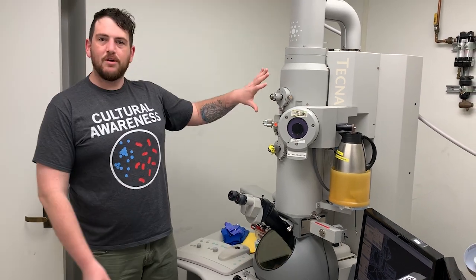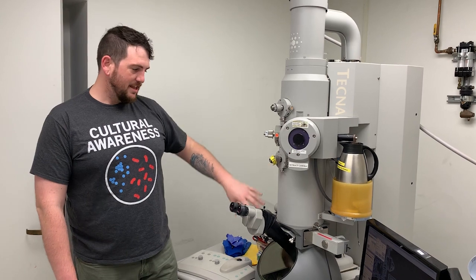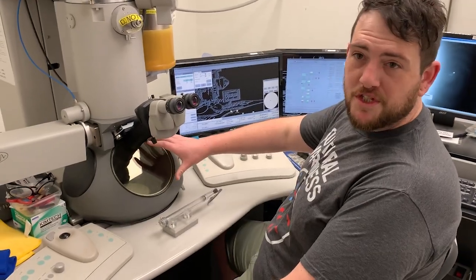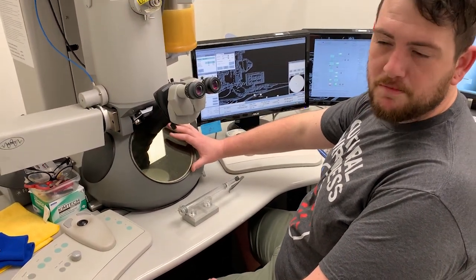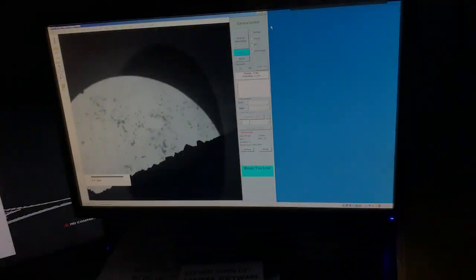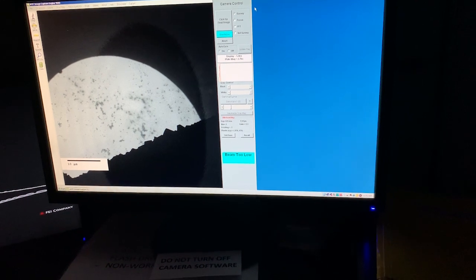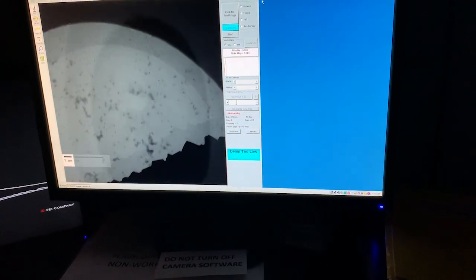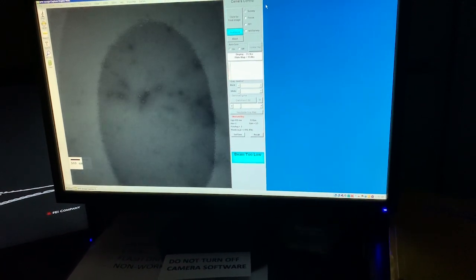The image that forms as the beam transmits through your sample is then focused, magnified, and viewed below. The image that's formed of your sample is collected on a camera or can be viewed in this fish bowl below. At low magnifications, viral particles are indistinguishable, but as we zoom in, we begin to see individual viruses.